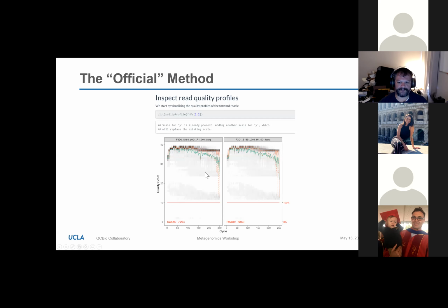I'm going to be frank, this friggin' sucks. But this has been kind of the standard method when running DADA2 for doing the quality analysis. And what I was finding was people had a tendency to not always be able to pick the best trimming sites for the forward and reverse reads, and people tended to be very overly restrictive with the expected error rates.